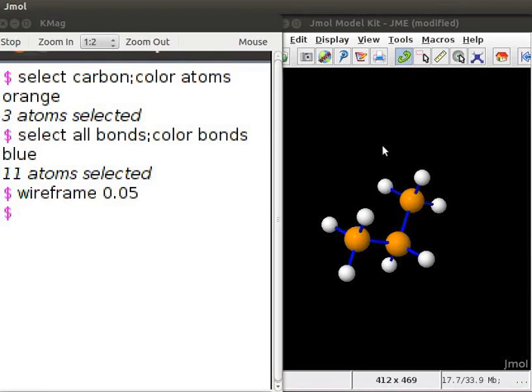Similarly, to increase the size of the bonds, at the prompt, type wireframe 0.1. Once again, note the change in the size of the bonds.